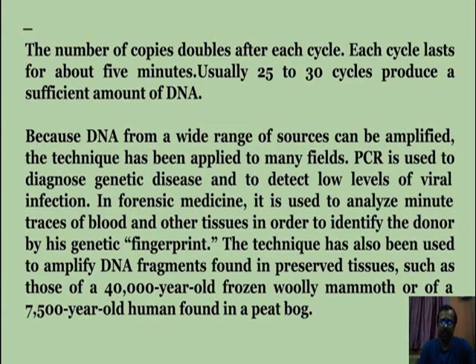So from these tissues, or dead remains, we can even amplify the DNA by using this important technique.